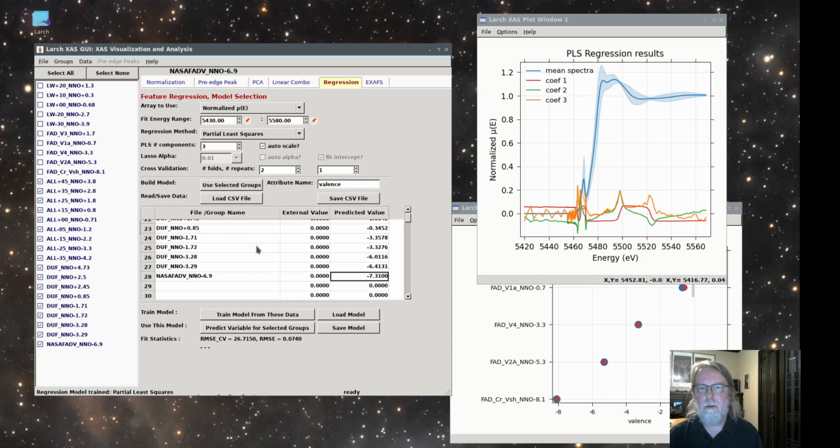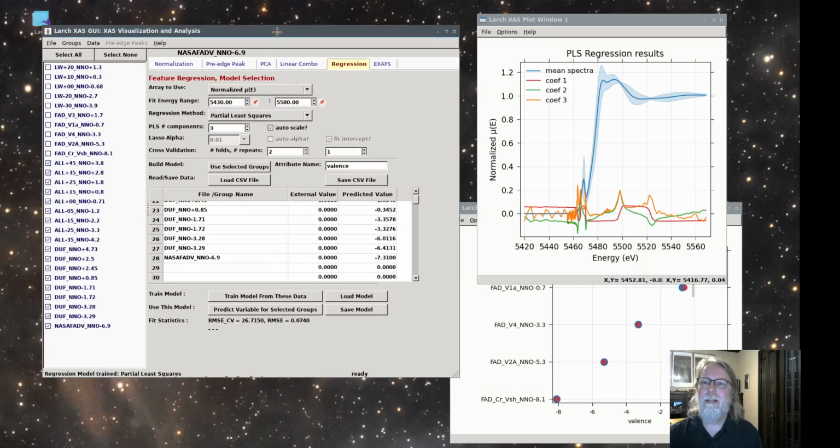But here you can use a range of data sets to predict some other external variable value. So whether that is pH or EH, or again, some composition or some reactivity measurement, some measure of what your sample does, its efficacy as a drug, say, or its ability to change its environment, and so on. That might be something that you would want to consider being able to analyze from your data sets. And again, with a simple training, that can be done and applied in a relatively easy manner to a wide range of data sets. So I hope this was clear.